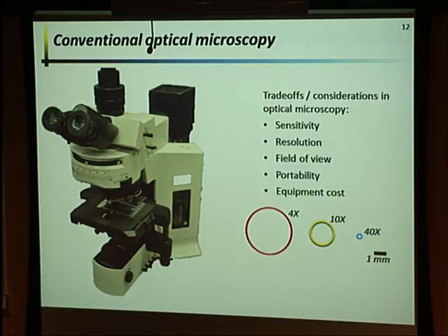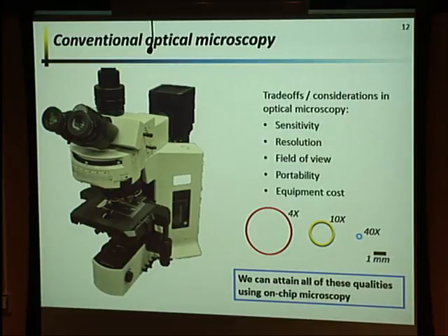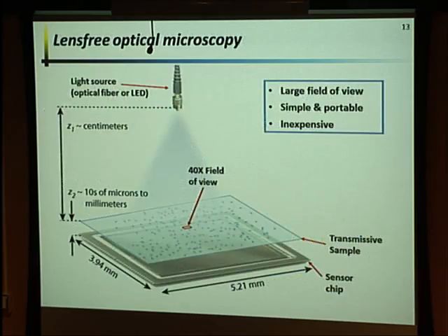Also, if you want to detect the smallest possible particles, you typically need fairly large, bulky laboratory equipment that can be fairly expensive. So I'm going to show how we can attain all these qualities using on-chip microscopy.